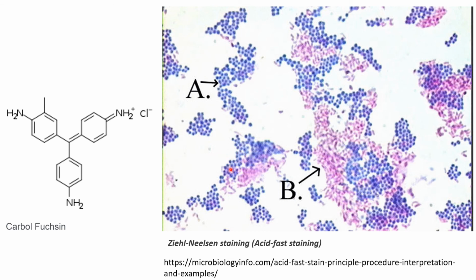Why positive staining? Because this stain or dye goes inside the cell, and we're visualizing the cell itself. In negative staining, it usually stains the background and the cell is colorless. That is what we call negative staining. Later I will explain the purpose or function of negative stain.